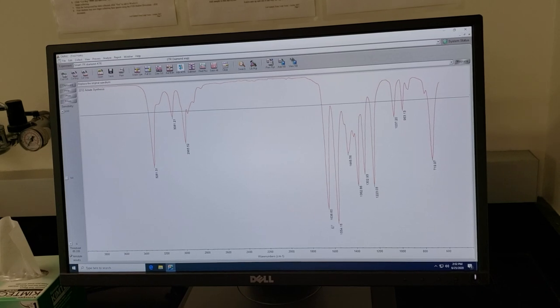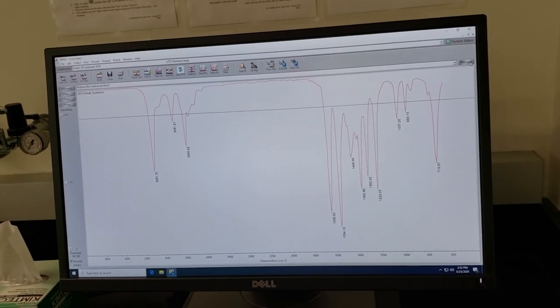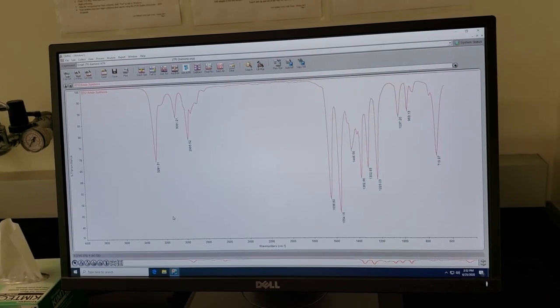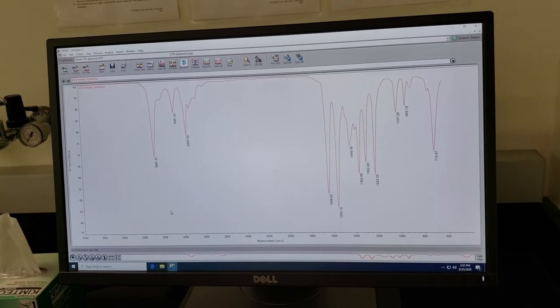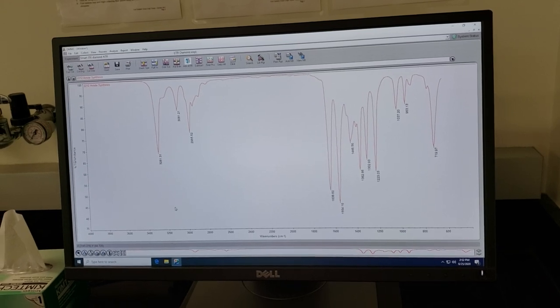We've also got our peaks down below here. We've got a 1638 and a 1500-ish peak. Let's hit replace. We've got our values. We'll go ahead and post this up on ELC so that you can go through and identify the important peaks related to your Amide product.